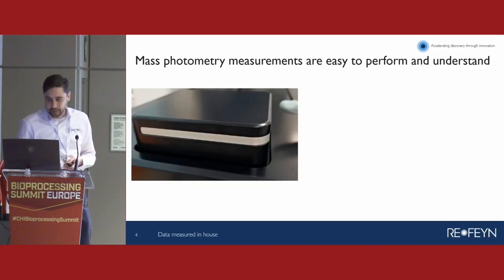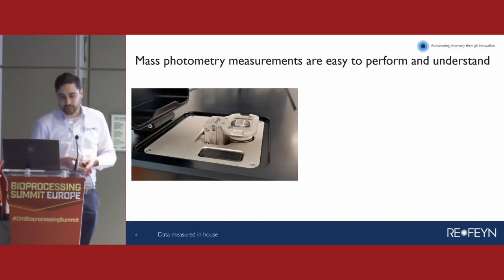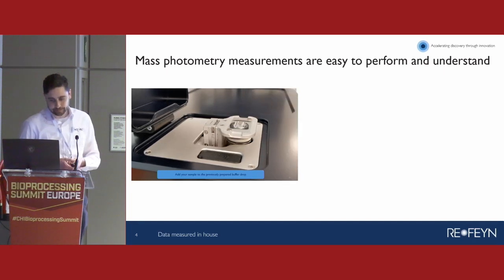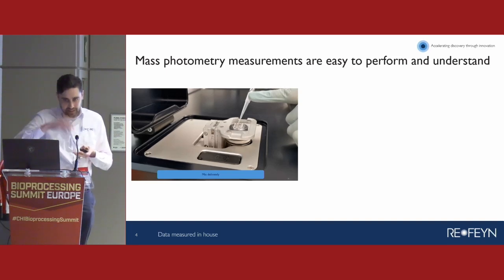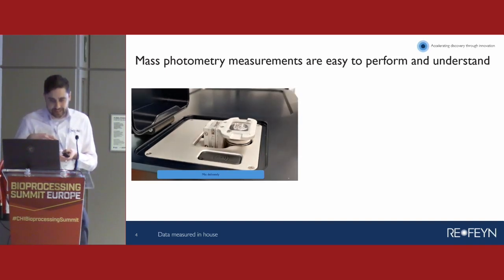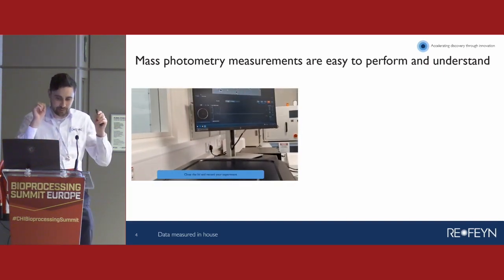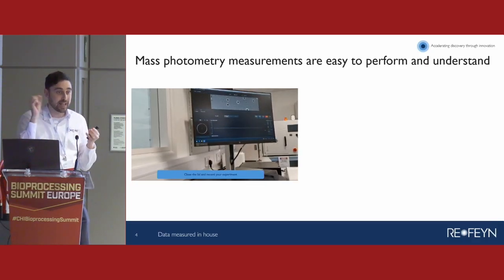So to give you an idea of how this looks, you open up the cover, you pipette on some sample, give it a little mix, and those molecules are starting to bind to the glass. And in a second, the camera will pan up, and you'll be able to see dots appearing at the top of the screen. And each one of those dots is one protein molecule landing on the surface, and by looking at the darkness of that molecule, basically, we quantify its mass.